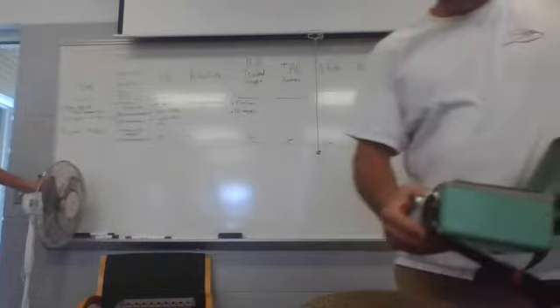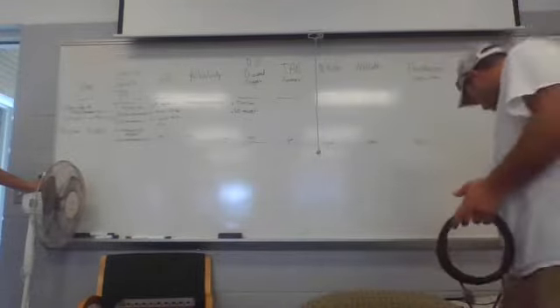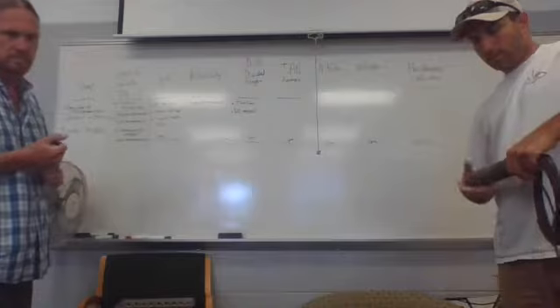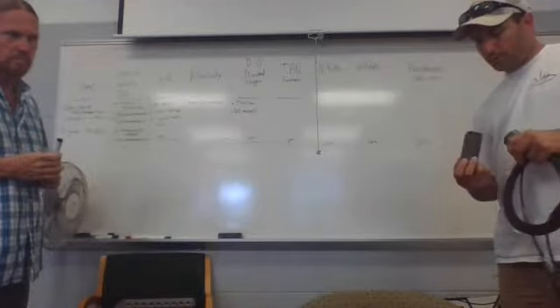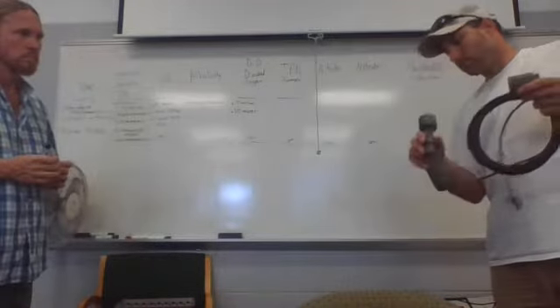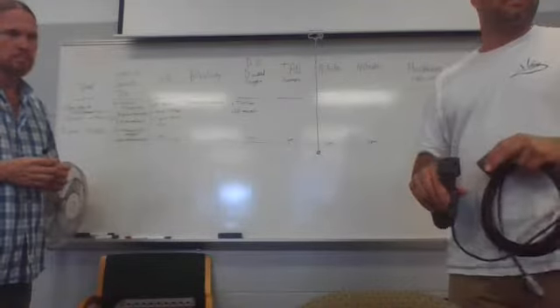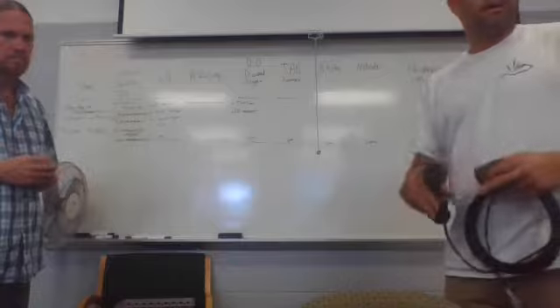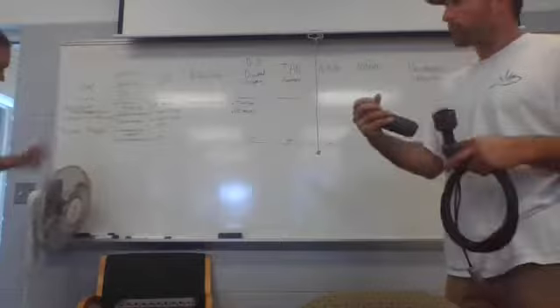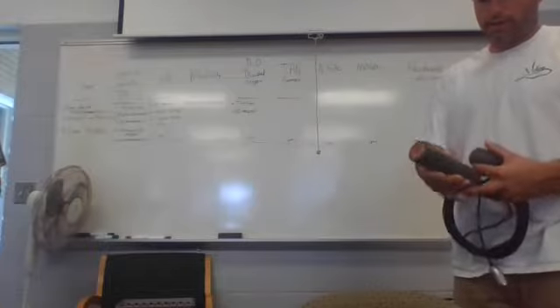It looks like it's going to be measuring some sort of conductivity through the water. Let's see what this probe looks like. So the main types of this is the batteries, and this must be the unit. I guess it must be a membrane unit. So there's basically a little electrode here, and then it has a membrane, and it draws the oxygen across the membrane and measures the rate at which, or the number of oxygen molecules, or how much conductance you get.